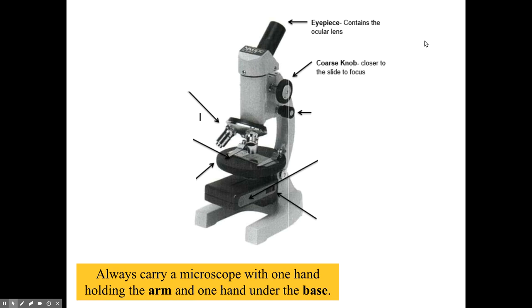The coarse knob is the larger knob. When you turn it, it moves that eyepiece up and down so you can kind of zoom in and out of your viewing.